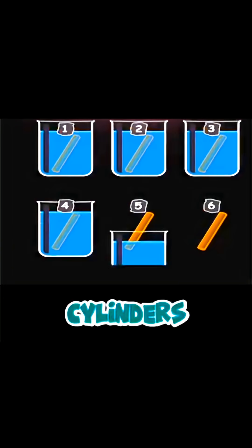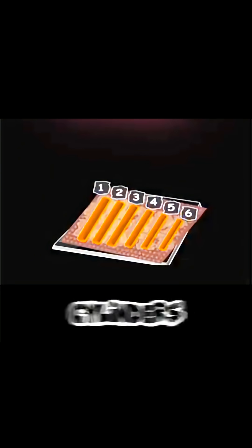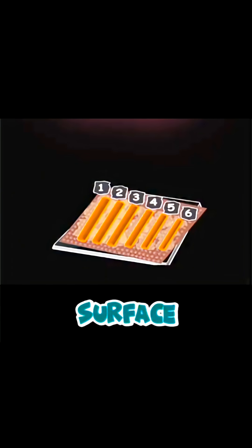We will soak those cylinders into solutions that have different concentrations. We will allow them then, for about 6 hours, and dry those cylinders on tissue papers, just to make sure that we are only measuring the content of those cylinders, not the water on their surface.